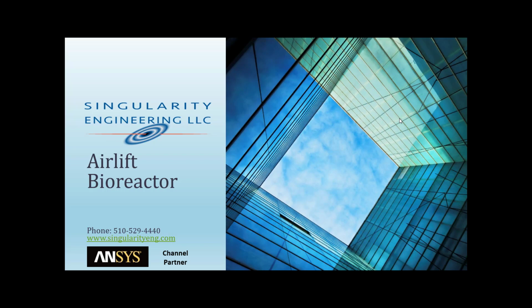Today, I am going to talk to you about the Airlift Bioreactor. Also, I am going to explain why CFD is a very important tool in the bioreactor's design. I will also talk about how we can use CFD for the scale-up process of this equipment.